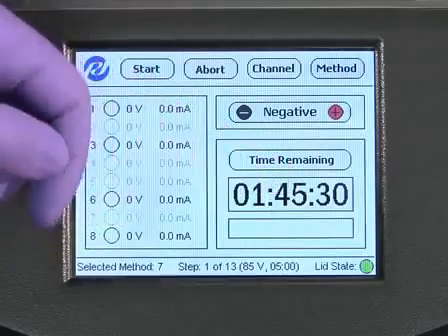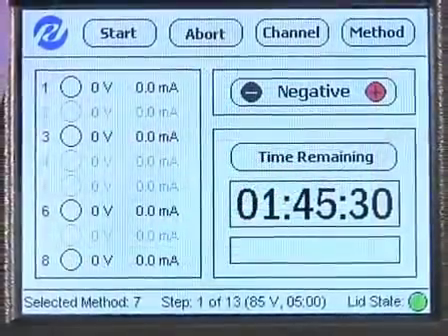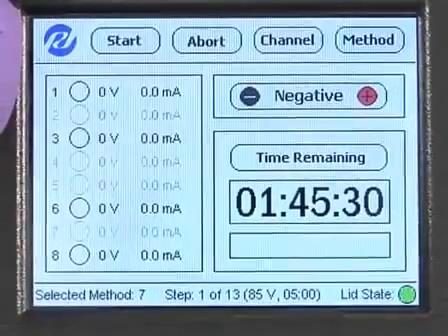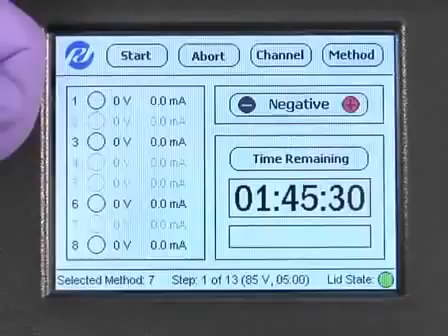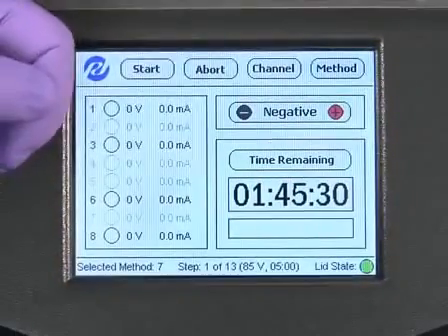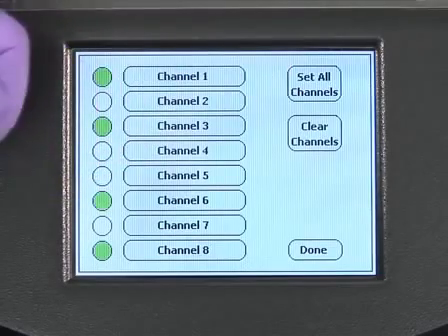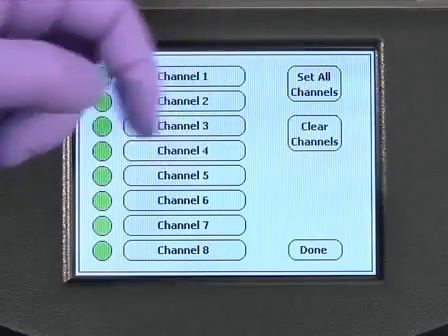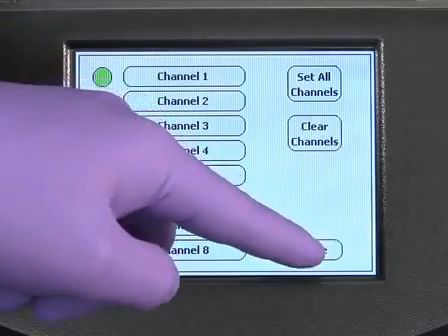The method that has been applied will appear at the bottom of the main screen. Each of the pre-programmed methods consists of set voltages and time-based pauses designed to resolve proteins within a specific range of molecular weights. Once the appropriate method has been selected, press the channel button on the main screen, then select the channels that will be used in the run. To select all 8 channels, press Select All. Then press Done to return to the main screen.